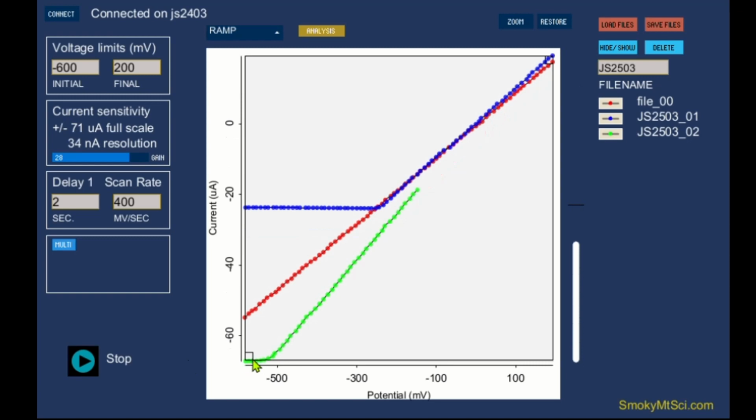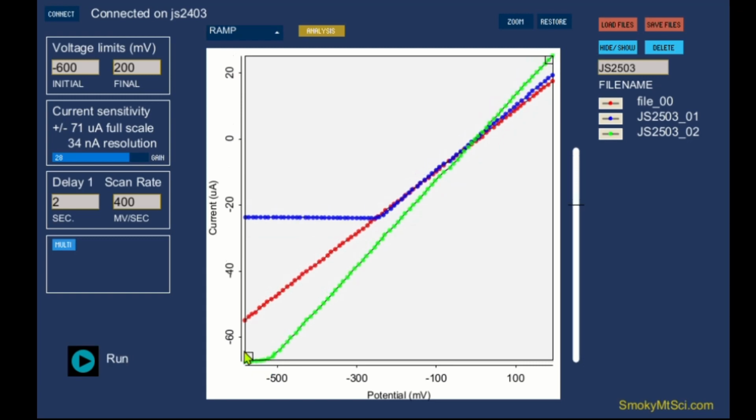And we still have a little bit of flat area there, so let's give a little bit less, 26, and that should be a legitimate amount. Probably could go to 27, but anyway, that's how you use the gain slider, right? So this is a slider. You slide it back and forth. I think we said 28 would be the desired place. So that's 28. Okay. All right, so that is how you use the gain.